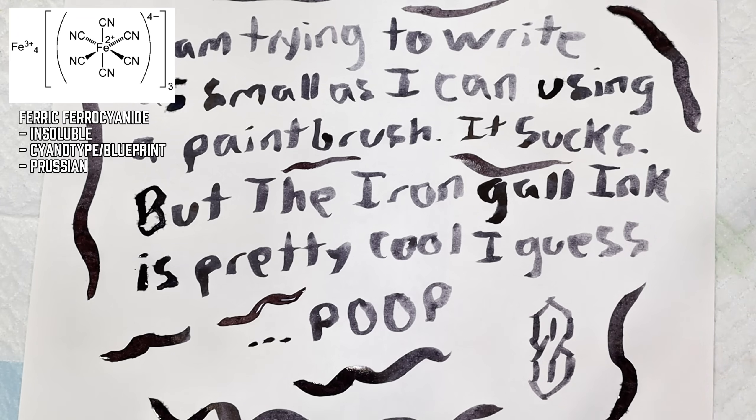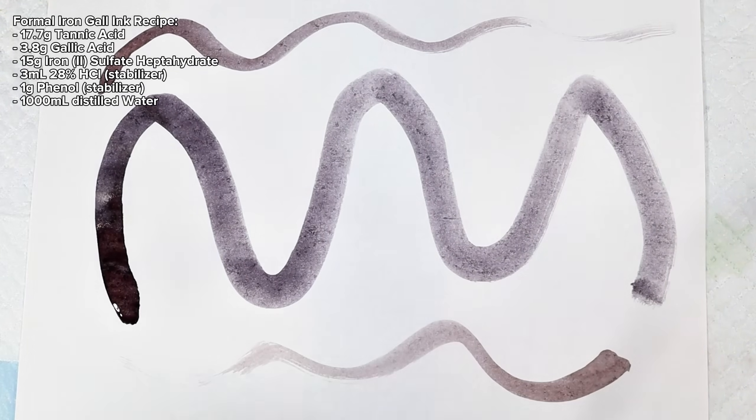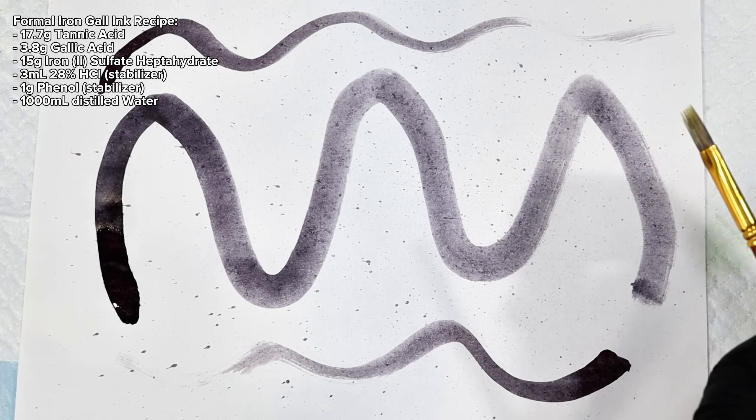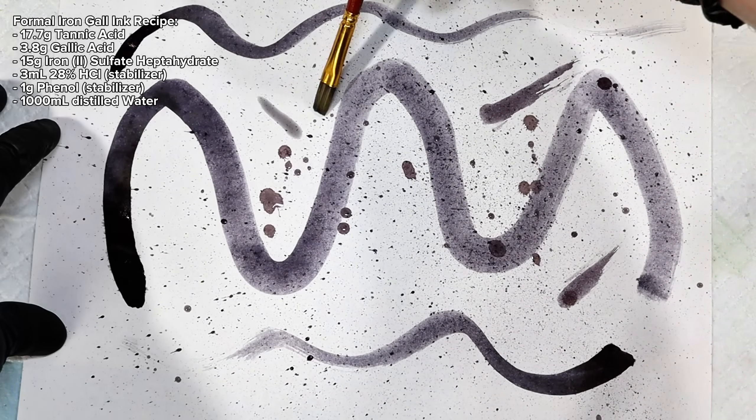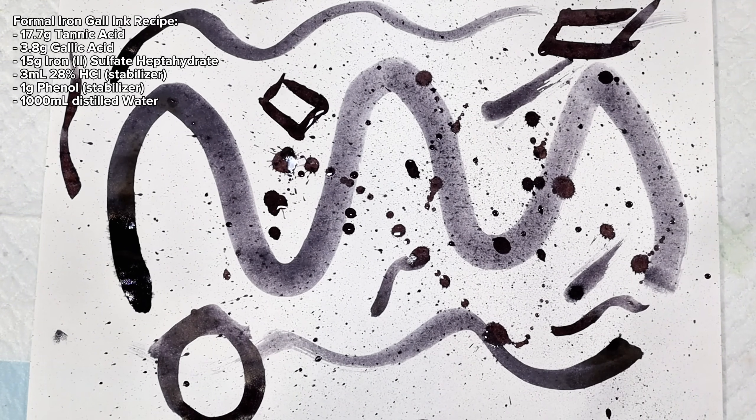As a few more quick notes: since iron gall ink tends to react with oxygen over time, rendering it useless as an ink, most of the time it was mixed just prior to use. Also, dissolved iron 2 sulfate isn't really stable without excess sulfuric acid, which wouldn't really be good for the paper.